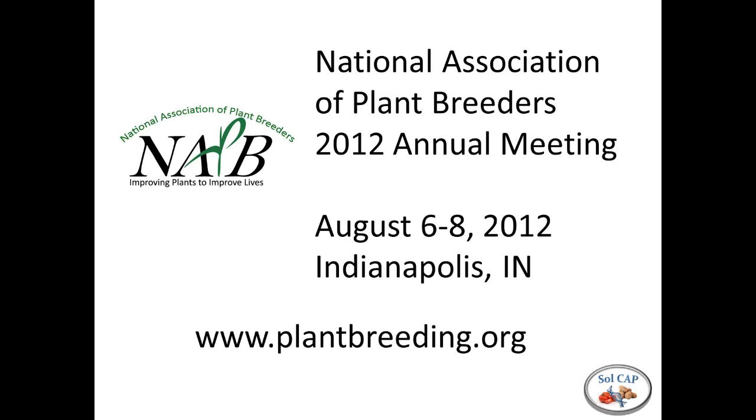There's a couple questions here about the input file format for MadMapper, and I can't remember if you showed the input file for that or not. No, I did, a couple times. The input file for MadMapper is the same as RECORD, and basically the same as JoinMap. I showed 2 slides where I had basically the genetic data with the lines across the top and the markers as rows, and where you're just defining a file, basically the file name, the type of population, number of individuals, number of markers, with a header at the top. Sure. So it sounds as though it's a pretty standard file format. Exactly. Yeah, you can basically use the same file for JoinMap. Perfect. With the exact same file.